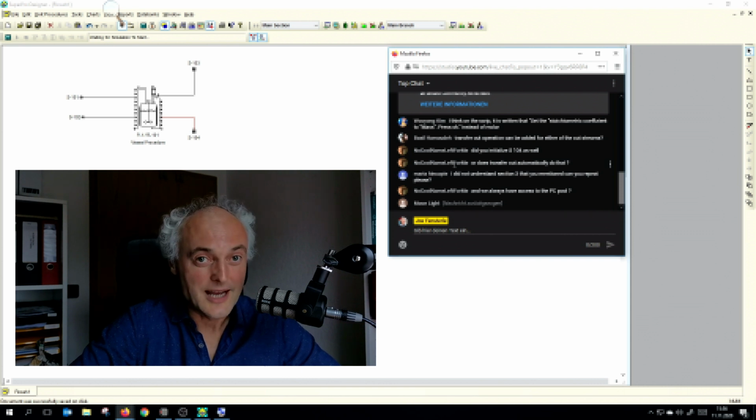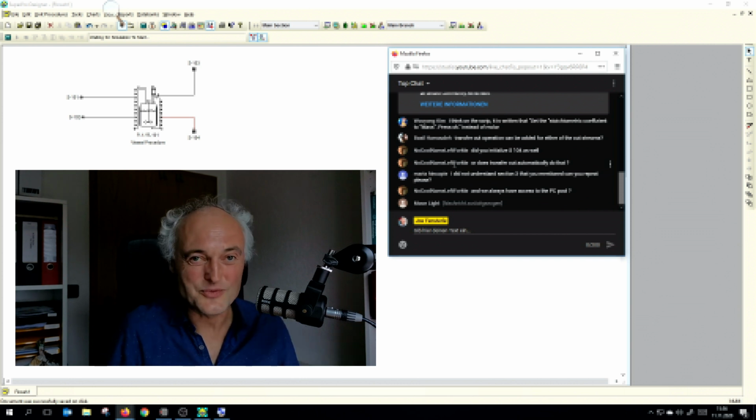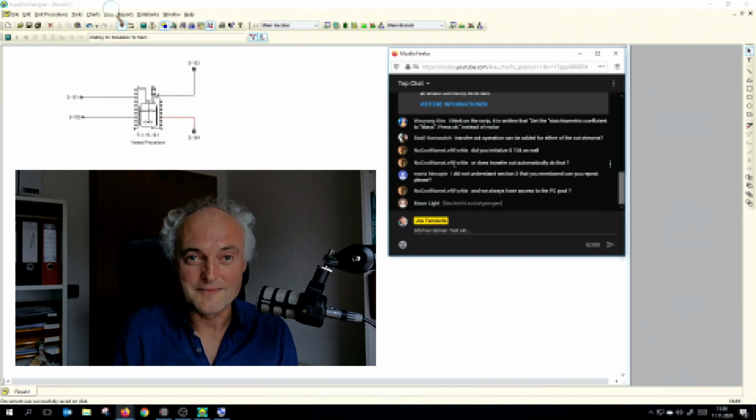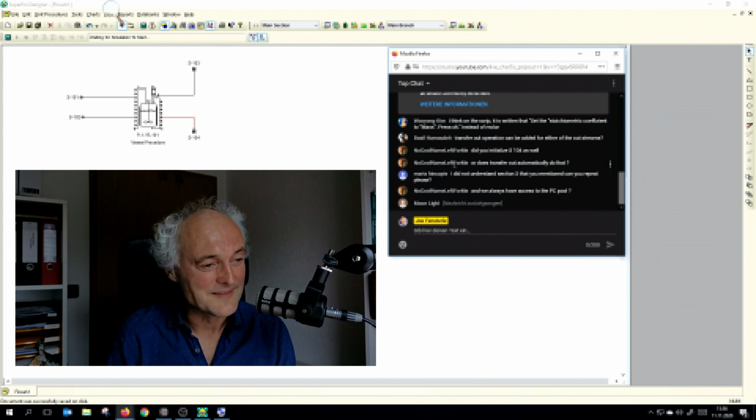It will do it. I think this would be the perfect playground for Donald Trump, because you can tell the software whatever you want, and maybe sometimes there is an error, but sometimes it just gives out a result, and the result might be nonsense, and your job is to understand what is happening there. Yeah, so that's the problem here.